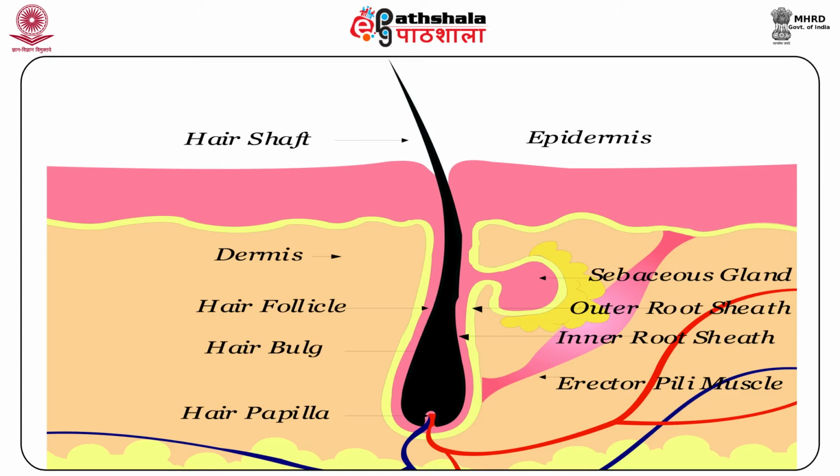The possible nature of the weapon with which the hair has been severed is also revealed. With blunt weapons, the cut end is found frayed and irregular. With sharp-edged instruments, the cut ends have sharp edges.